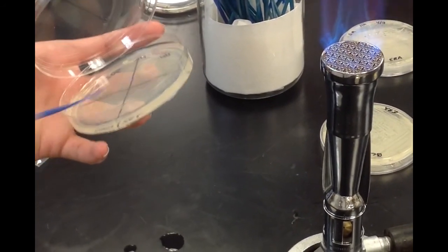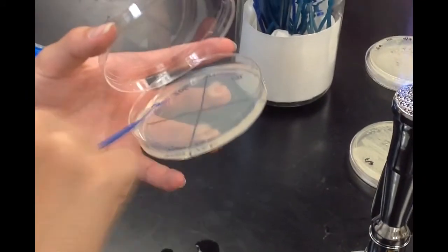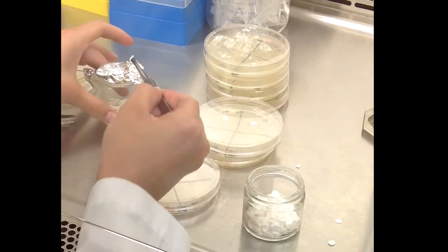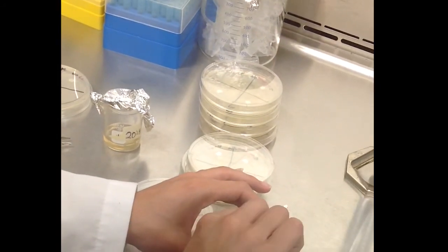Later, we made the various solutions by adding, for example, in the 5%, 9.5 milliliters of distilled water mixed with 0.5 milliliters of honey. We later took those solutions and dipped a sterilized hole punch into them. Then we carefully placed them in their respective agar plates with the bacteria on them.